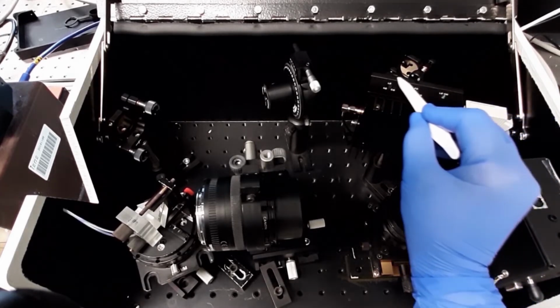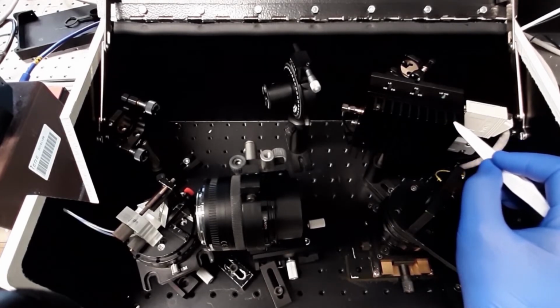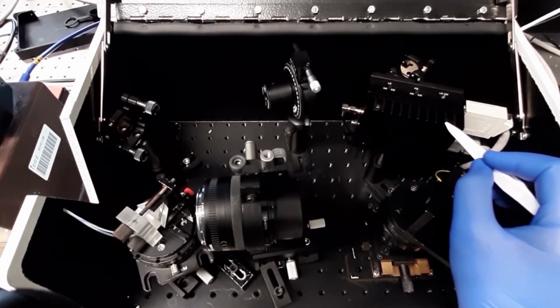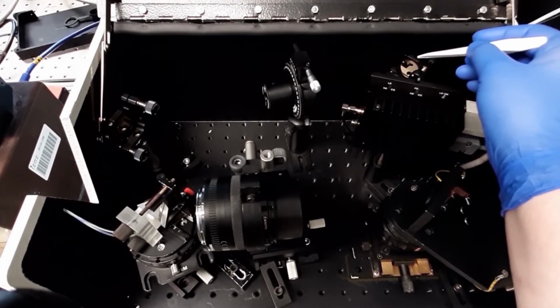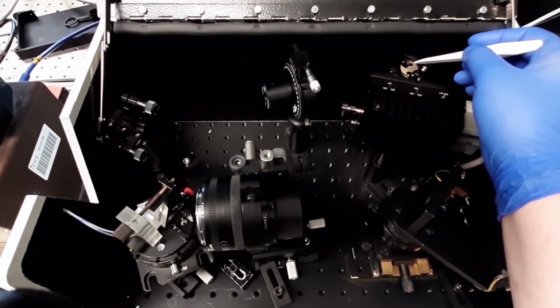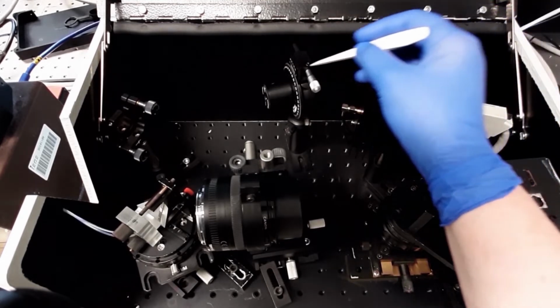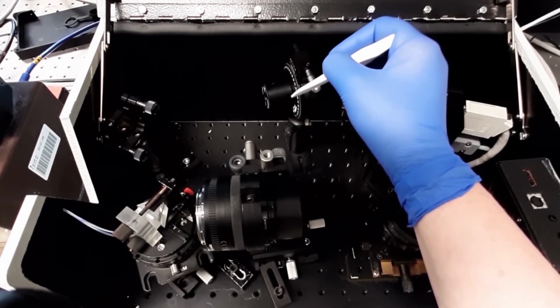You may see over here the laser, in our case a red laser, with the wavelength 675 nanometers. This laser serves us as the source of the light. The laser beam comes onto this mirror, is reflected, and passes through the polarizer, which is located over here.